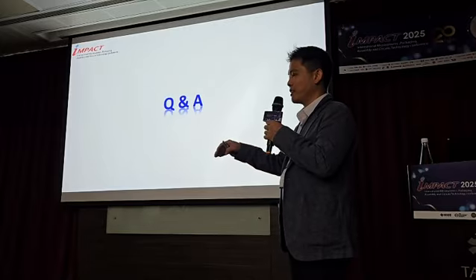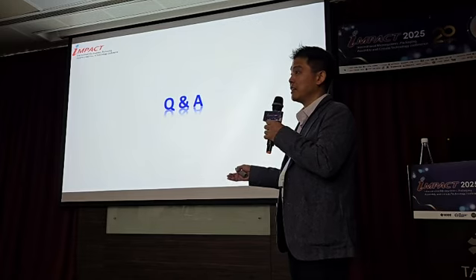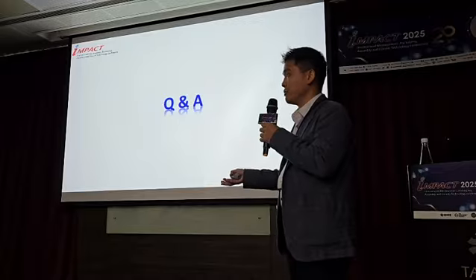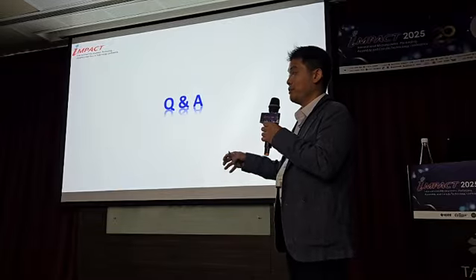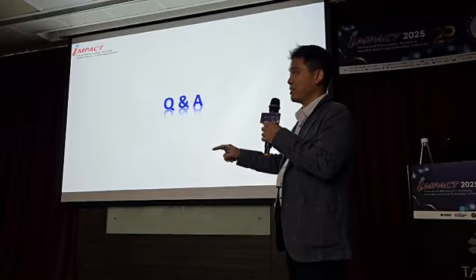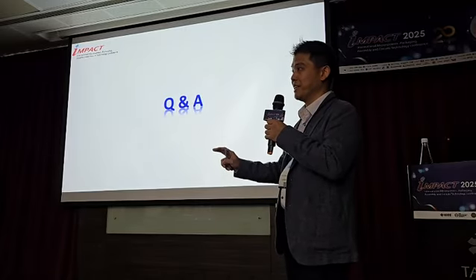But if there is material hanging on the side wall that led to the formation of the crack, or let's say there's a difference in these TGVs, maybe on the side wall there's a slightly different stress on the silicon dioxide, then infrared spectroscopy is going to tell us what the strain on that silicon oxide is by looking at the position of the silicon oxide bond on the IR spectrum. So we can do all that, but it depends on what the subject of interest is.